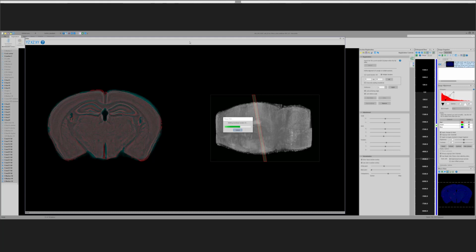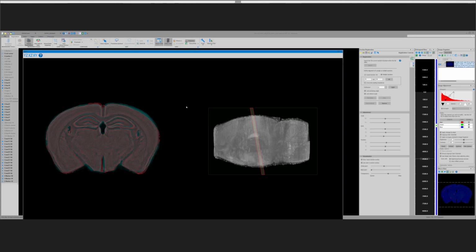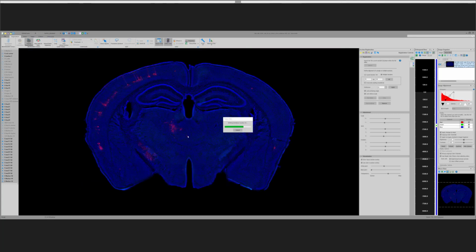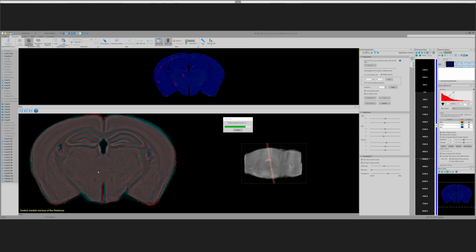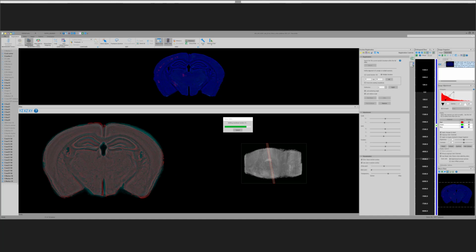So when this is done, I'm going to... Brian, you're supposed to remind me now. Yeah, I really want to take a look at the anatomic regions in the atlas. Yeah. Okay. I think this is so cool.